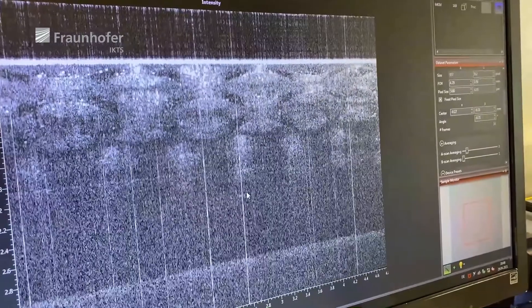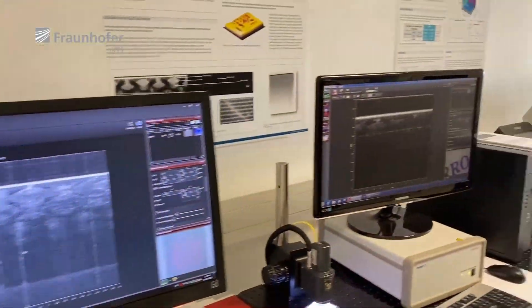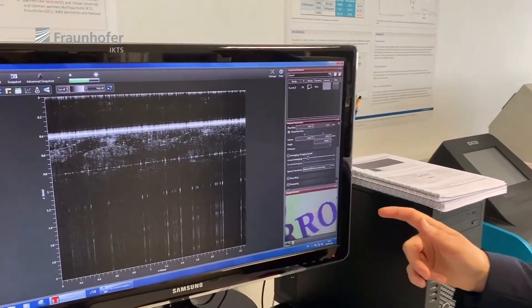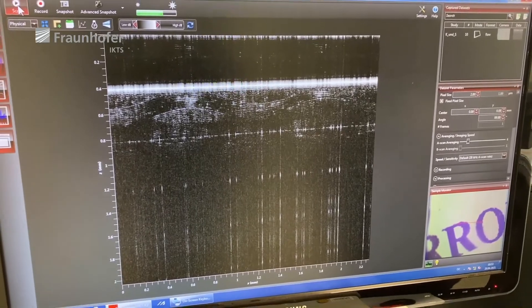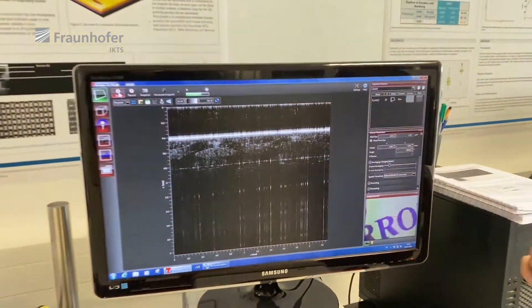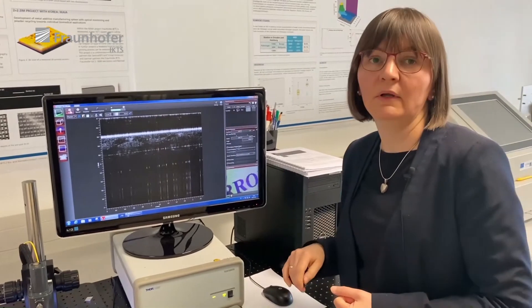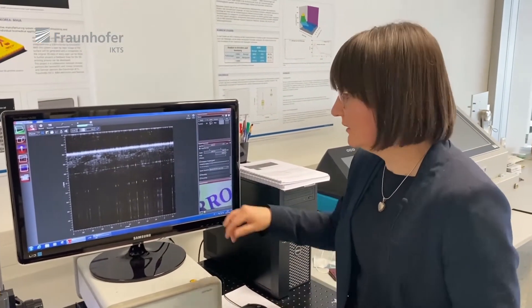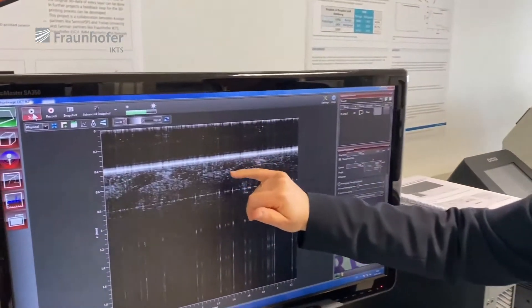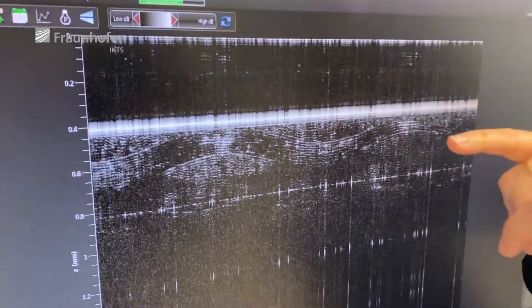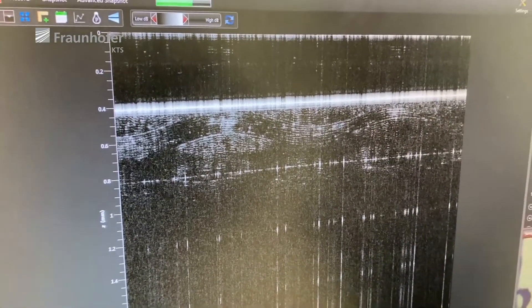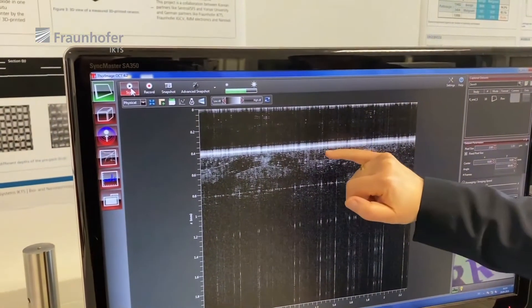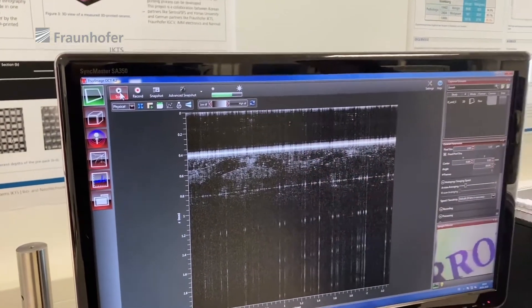The same sample I imaged previously is shown here on this system, but this system uses light with a central wavelength of 900 nanometers. That means I have much higher depth resolution, and in this case I can see the actual single glass fibers arranged in different bundles going perpendicular and parallel to the B-scan. You can immediately see the difference — in this case I can see maybe two to three layers of bundles, whereas in the other system we saw at least six of them.